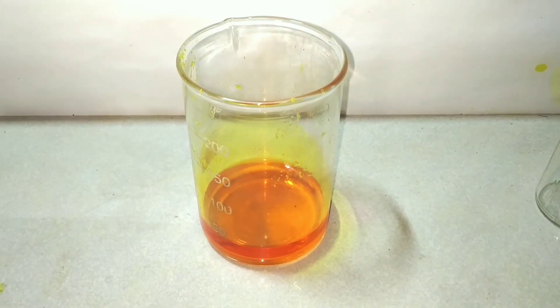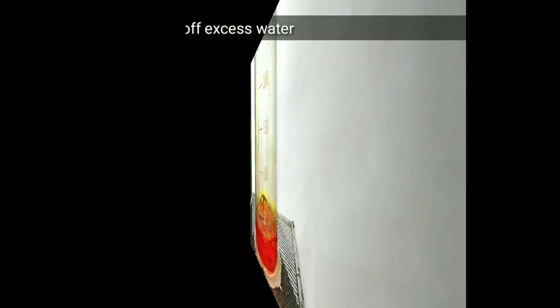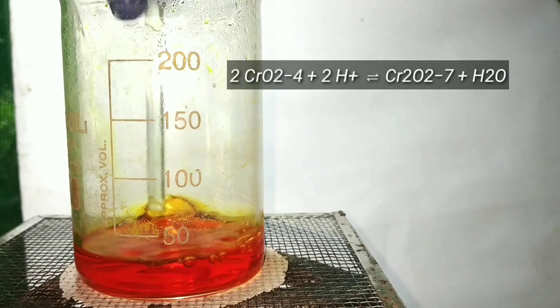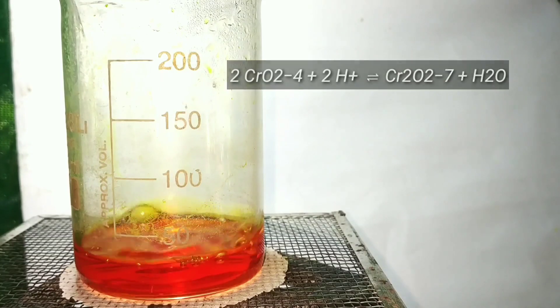The chromate to dichromate conversion is dependent on pH. If the solution is acidic, the chromate to dichromate reaction takes place. And if it is basic, the reaction proceeds backwards. Now as we always do, boil off the excess amount of water and stop the boiling when the crystallization point is reached.